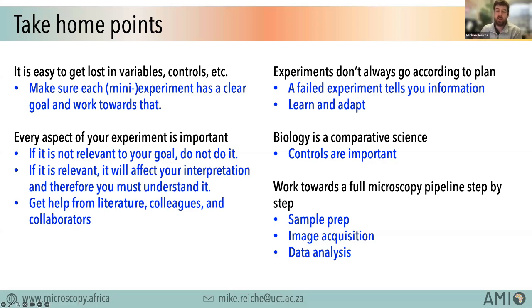It's a very good question. Unfortunately, it's not one that I can answer up front because, as I mentioned early on in my short webinar, it's very dependent on the exact biology that you're looking at. Some biological phenomena are very subtle, and because of their nature of being very subtle, you have to measure a lot of samples in order to confidently discern the differences. Some biological features are more apparent, and you don't need that many histological samples.